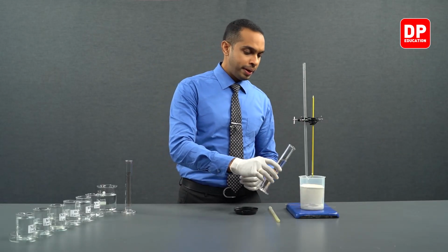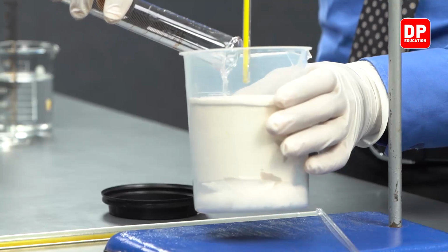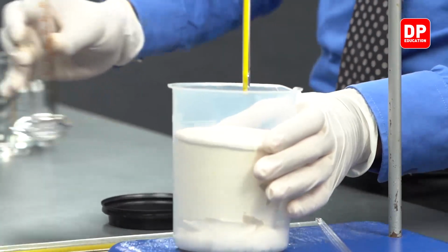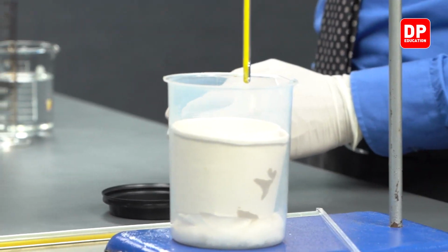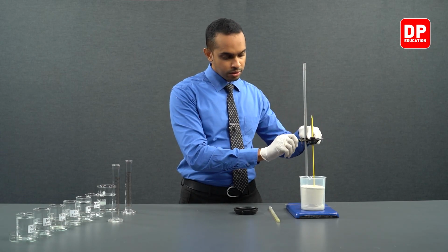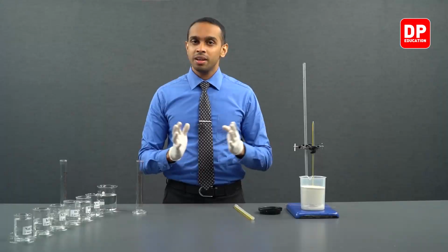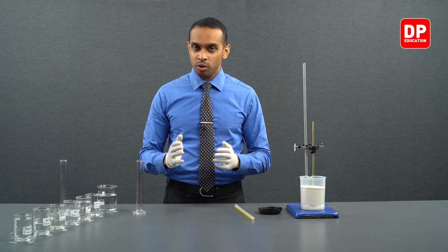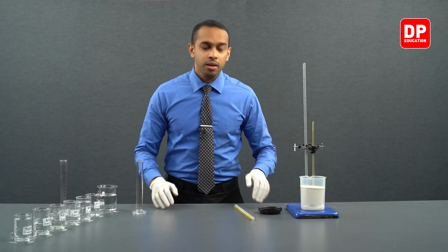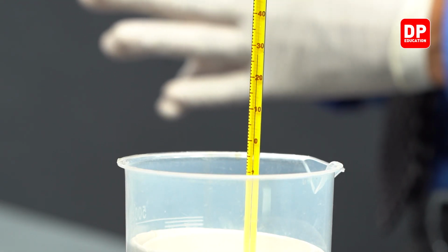Now, we are going to be adding this 50 milliliters of HCl into this plastic beaker. Afterwards, we can lower this thermometer into our HCl solution. Now, let's take a look at the temperature reading of our HCl solution. The temperature reading of our HCl solution is 27 degrees Celsius.